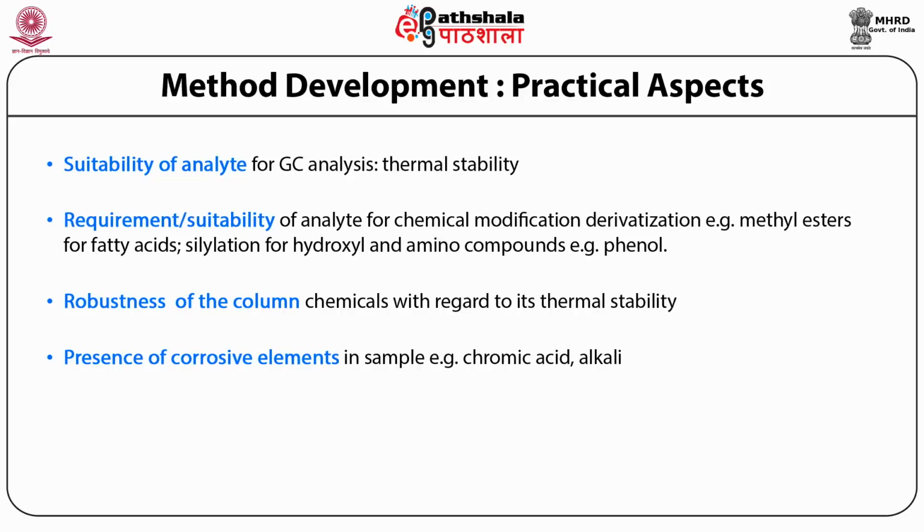And before starting out on the method development process and the standardization of the final methodology, the column needs to be conditioned and sometimes activated. Conditioning is a prerequisite before starting any of the programs or methods, and that essentially removes the components of bleed, and puts the column in readiness to accept the sample so that it can be analyzed in an optimal fashion.